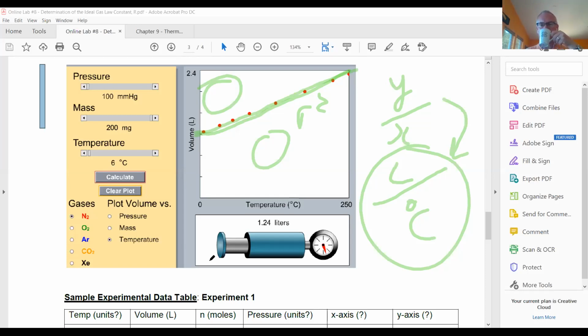Let's sort of chew on that for a minute. We're going to have to plot something else that when we look at this, at y over x, it's going to give us R. If these are the wrong units, how are we going to get the right ones? That's why I sort of want this lab to be a bit of a head scratcher.